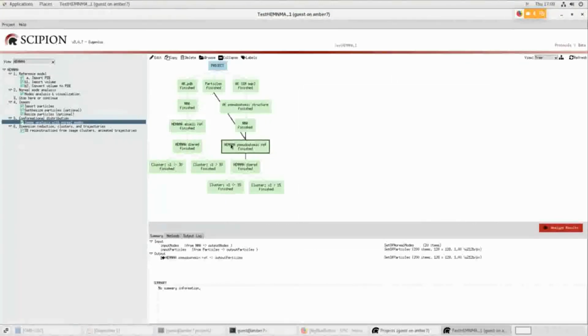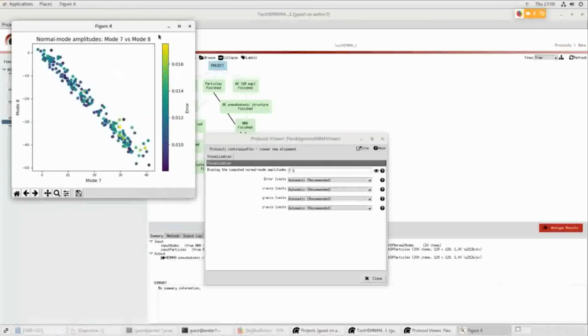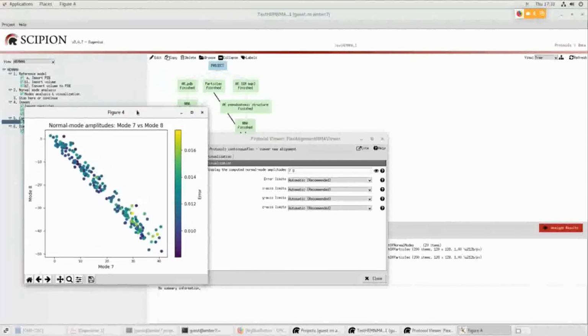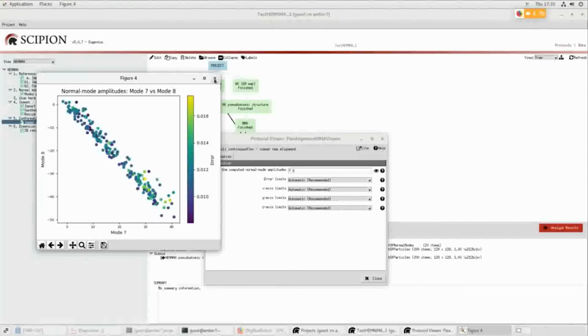And you would get exactly the same thing for the pseudoatomic structure, I mean the same visualization modes. Actually, between atoms and pseudoatoms, you can sometimes have a change of sign in the normal mode analysis. This is normal, because it's about oscillator types of movement, so both directions of the modes, because the modes are vectors, are valid.